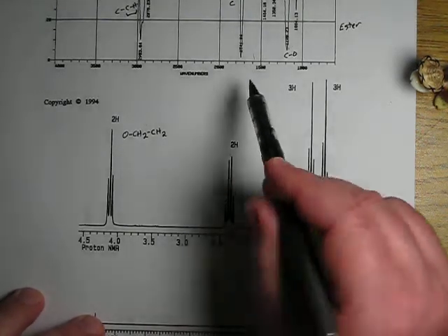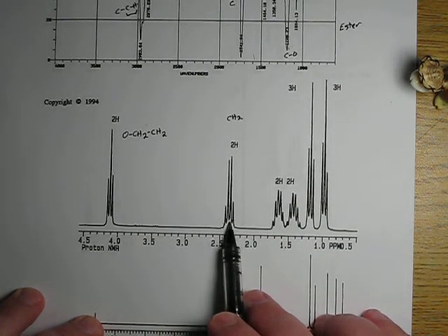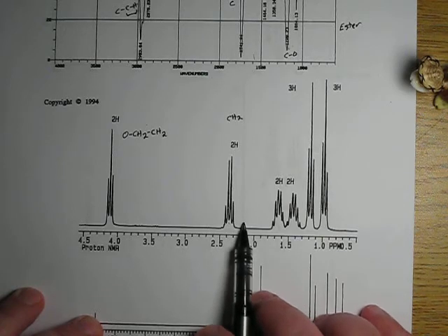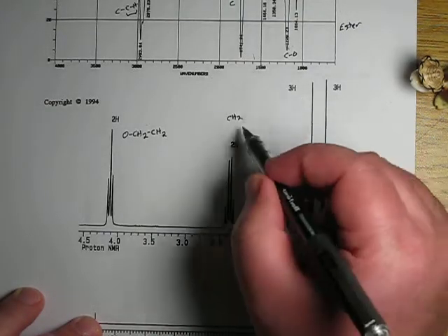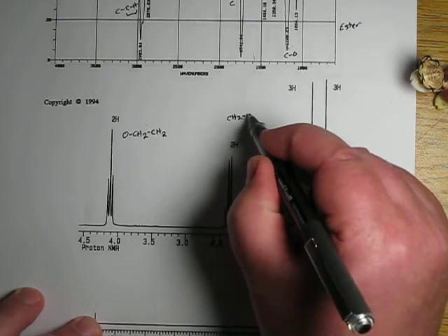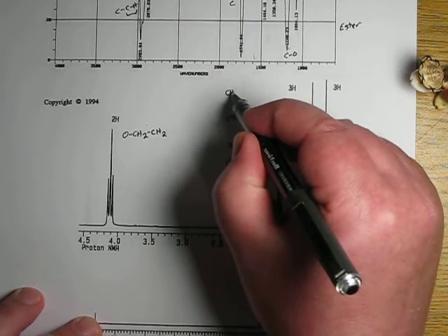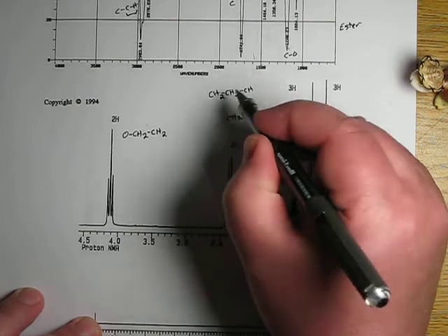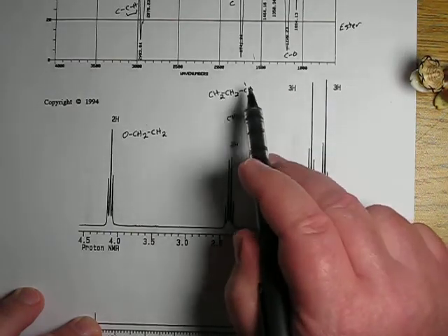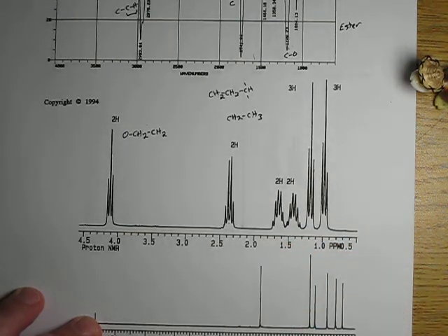2 hydrogens. Well, that's probably a CH2. Oh, it's a quartet. Why is it a quartet? Well, that means there are 3 hydrogens next door. And at this point, I could say, how do I get 3 hydrogens next door? Well, the most obvious way is a CH3 next door. That'll work. However, it could be that the CH2 has a CH on one side and a CH2 on the other, because a CH and a CH2 will also give us 3 next door and give us a quartet.